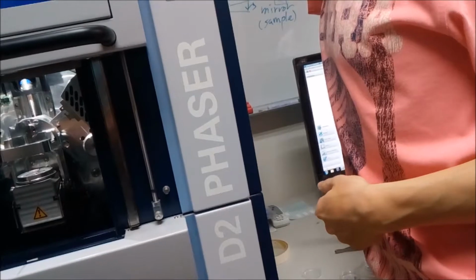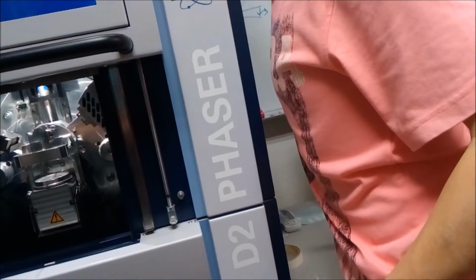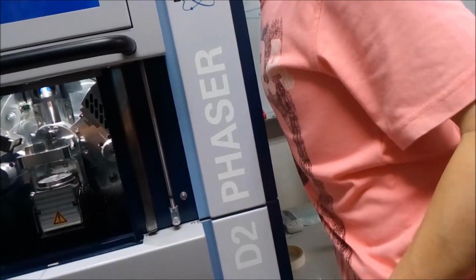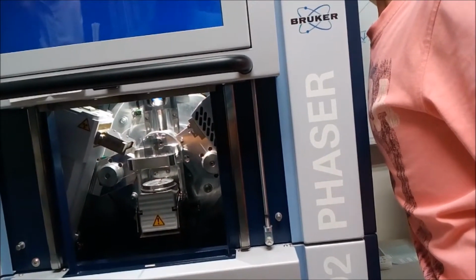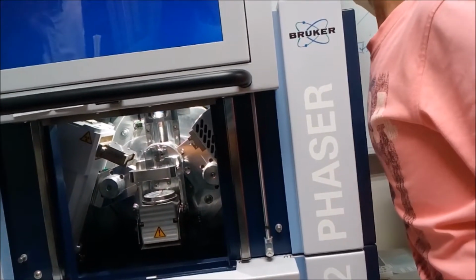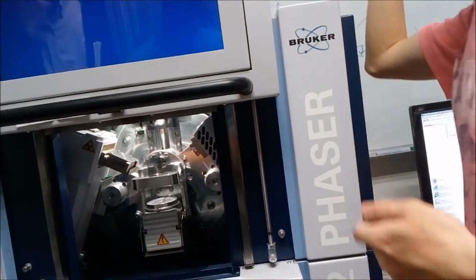No, it's G in the beginning. Grating, with a G. Yeah, grating. Did you know the grating? It's like it reduces the energy or something.